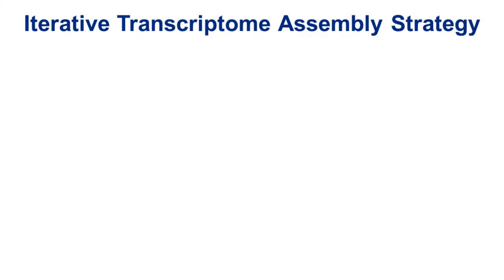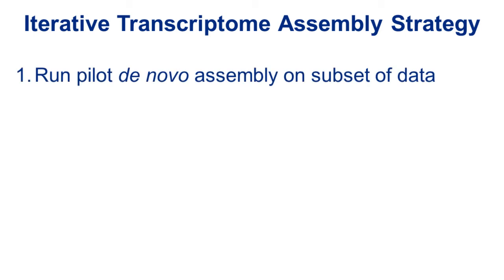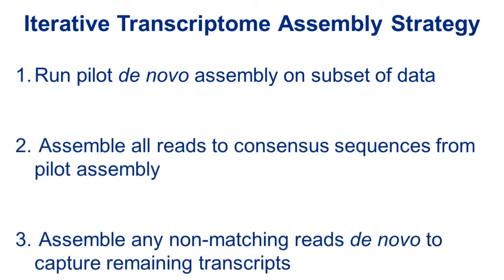With Lasergene Genomics Suite, you can perform transcriptome assemblies on a desktop computer. In cases where you have a large dataset but limited RAM, you may wish to perform your assembly in multiple steps, using a combination of de novo and templated assembly strategies.